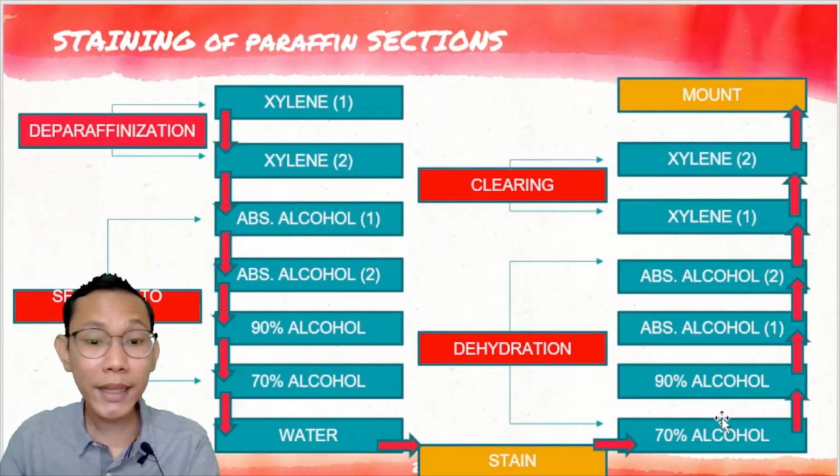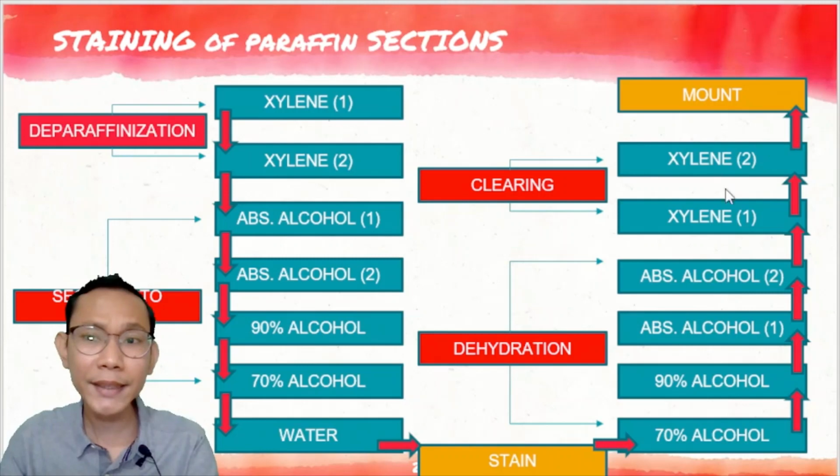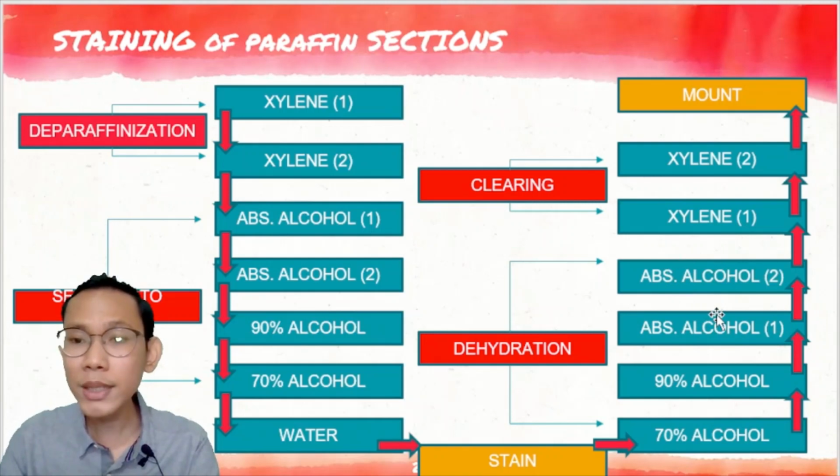examination. The stained section may be left in the xylene for an indefinite period of time until it is finally mounted sa ating slide. So, ayos lang na malagay natin yung sample natin na stained sa xylene kasi it will enhance your refractive index sa ating glass slide. However, the section should not be allowed to stay in your alcohol for a long time because many stains are usually removed by prolonged immersion in your alcohol. So, ayaw natin siyang ma-stay dito sa alcohol pero ayos lang sa ating xylene.